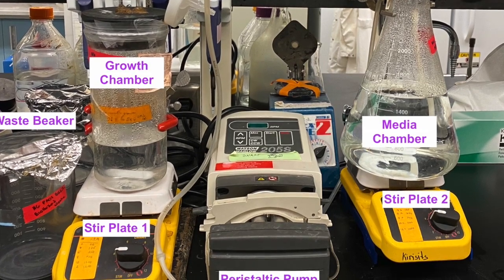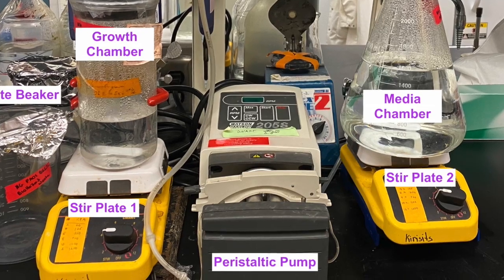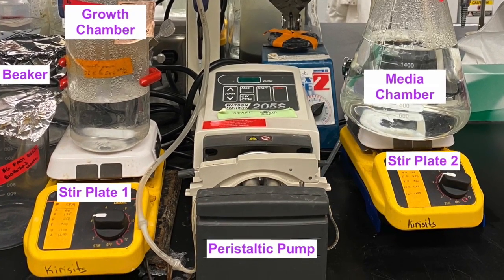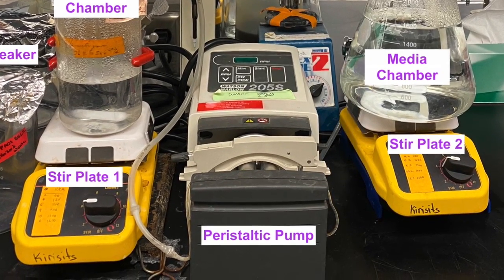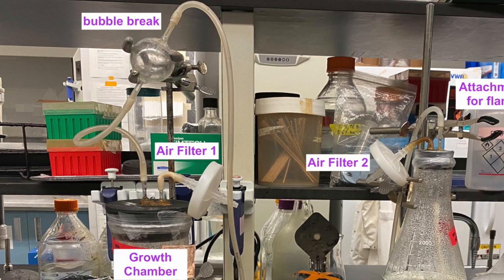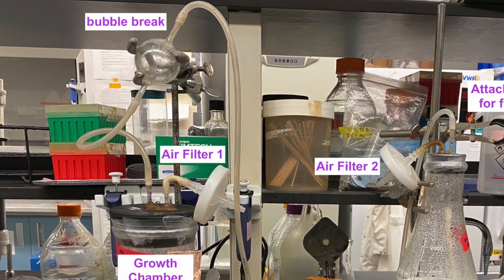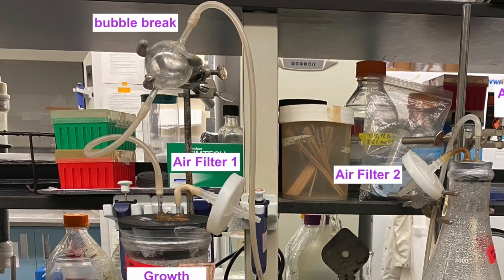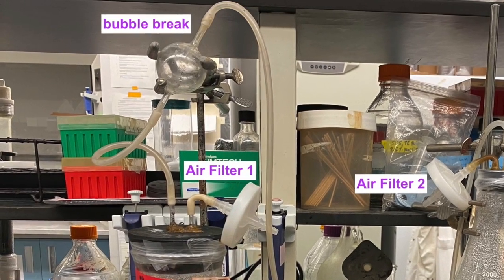Both the growth chamber and the media chamber sit on top of stir plates. This ensures that the concentration inside both of these chambers is homogeneous and uniform. There is a bubble break above the growth chamber to ensure that there is no backflow out of the growth chamber and into the media chamber.